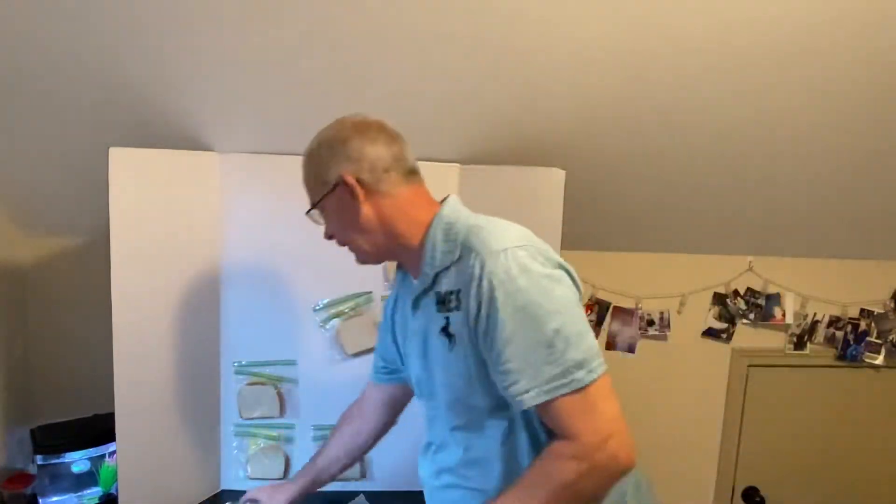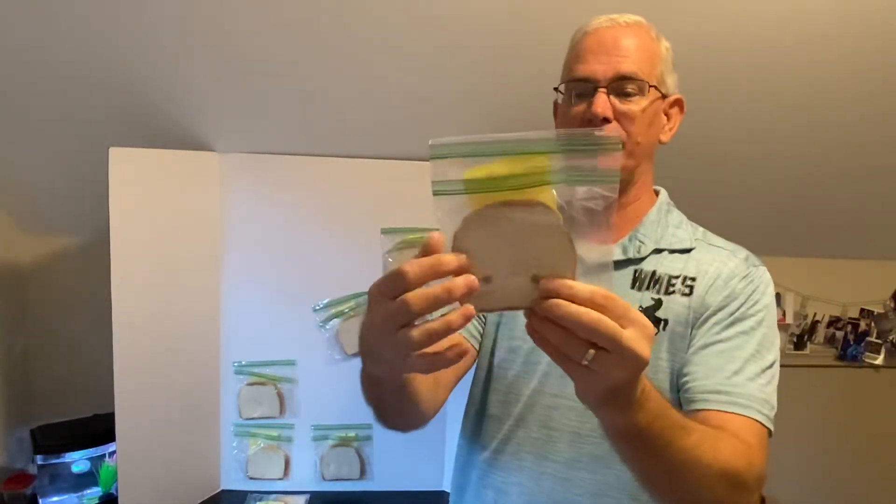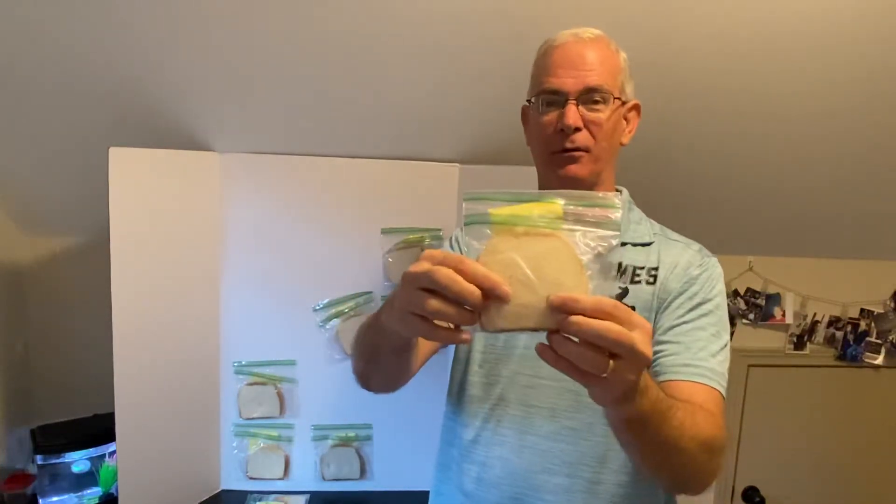But it should remind you of this one here. That's interesting — check it out. Another close-up, side-by-side. So what do you think this one was? Two little black dots right there. Students gloved up and pressed the white bread against the smart board. And that's what they picked up off the smart board. Took a few weeks to grow. Very interesting.